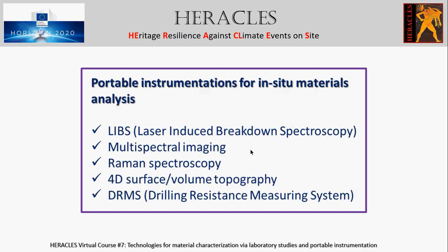And in these areas, we have, for instance, the portable laser-induced breakdown spectroscopy, which is a laser-based technique and provides information on the elemental composition of the area under analysis. It is a fast technique and has no particular sampling requirement, and it is suitable for fast screening of materials.